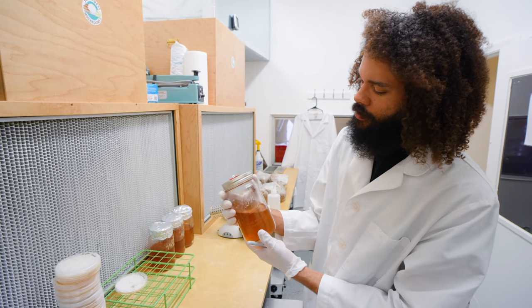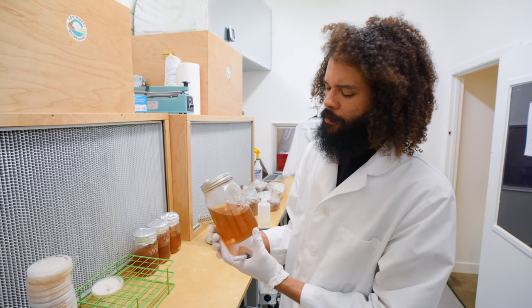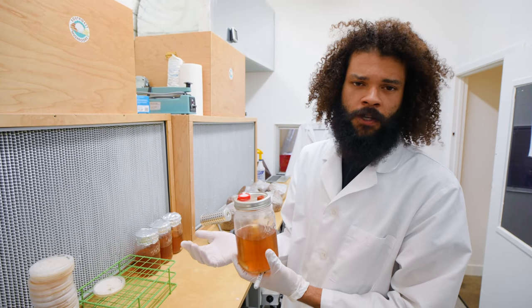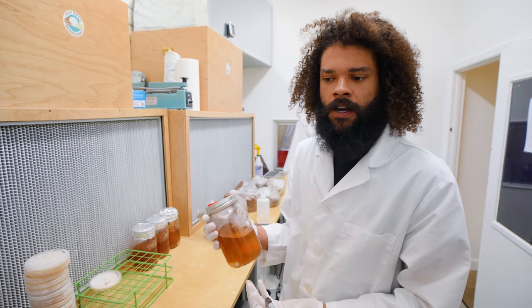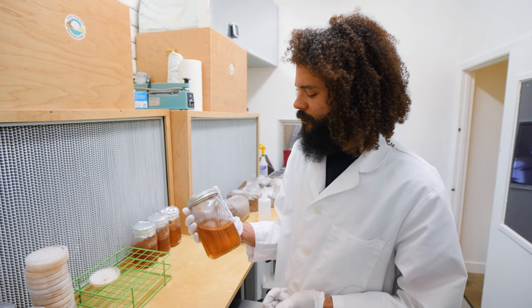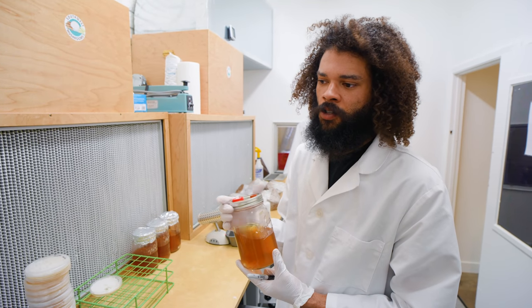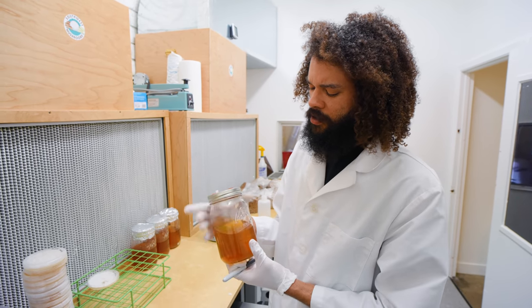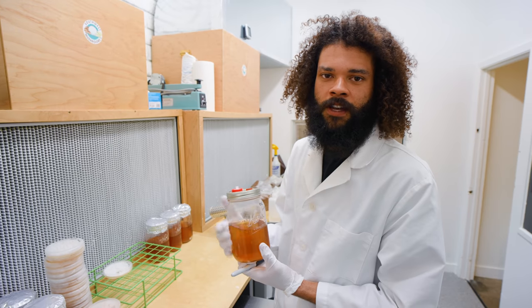Each of these jars is 500 milliliters, so we'll turn this into 500 milliliters of myceliated liquid culture. With that, we can inoculate one pound of grain spawn per milliliter — so that's 500 pounds of grain spawn. That can then be turned into another inoculation of 10 times its original inoculant, giving us 5,000 pounds of grain spawn from just one jar. That 5,000 pounds can inoculate tons of sawdust substrate, eventually being used to grow over 100,000 pounds of mushrooms.